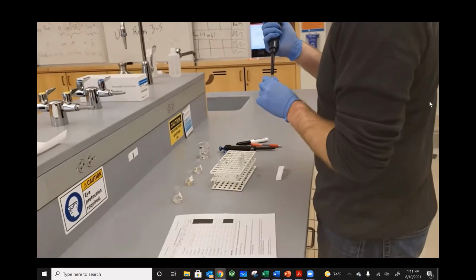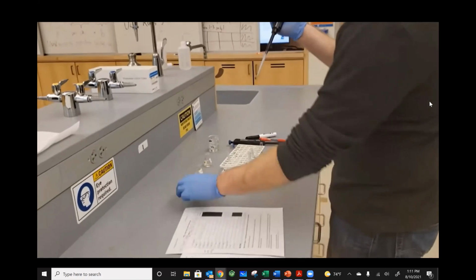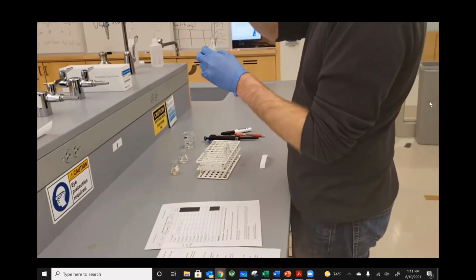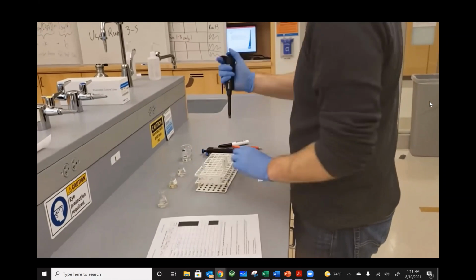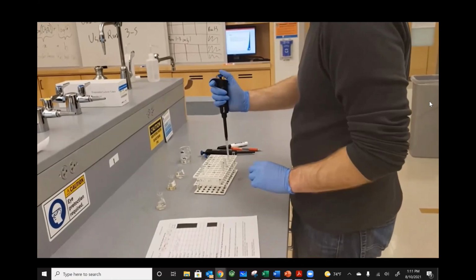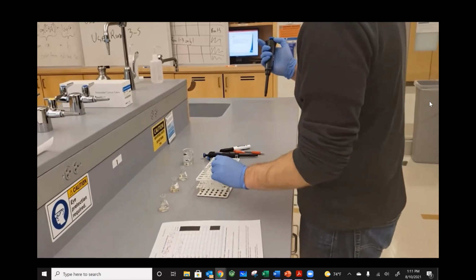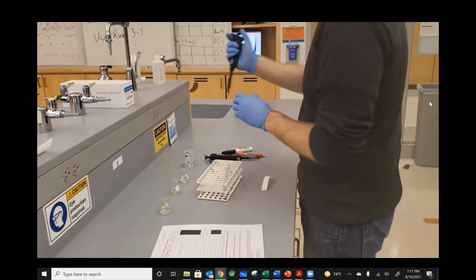All right, let's try this again. Got my 400 microliter tip for my hydrogen peroxide. Run one. This tip, tip for water.